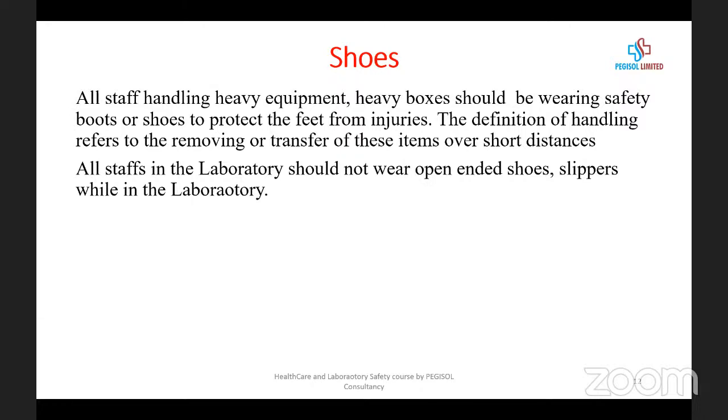So all staff handling heavy equipment, heavy boxes should be wearing safety boots or shoes to protect the feet from injuries. The definition of handling refers to the removing or transfer of these items over a short distance. So all staff in the laboratory should not wear open-ended shoes or slippers while working in the laboratory. This is very, very important. It's a non-conformance if you are found working in the lab with open-ended shoes or slippers.